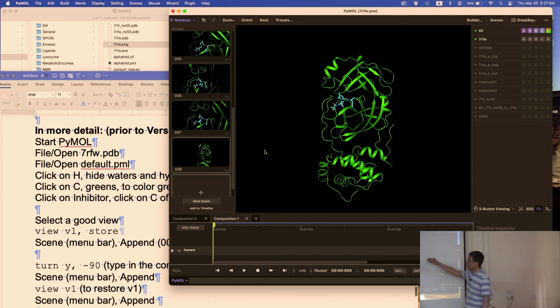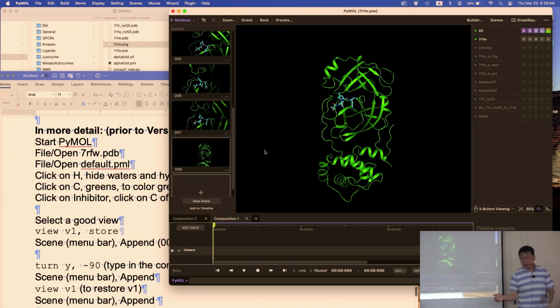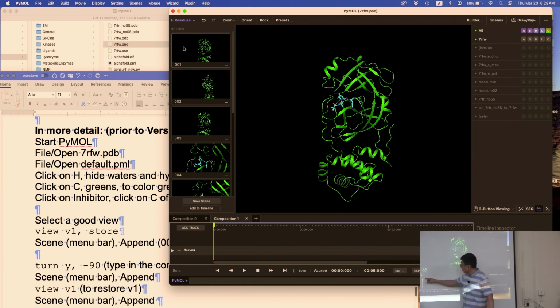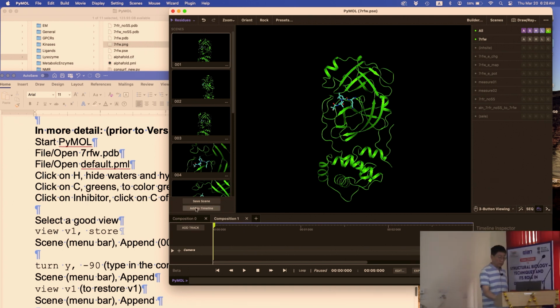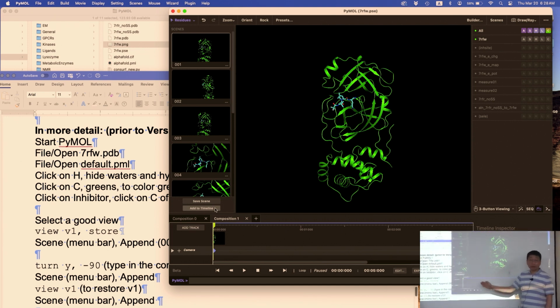So now we can individually add the scenes to the movie. And this is sort of how I learned how to do it. That might be a better way. But so go back to the top, click on the first scene to select it. Got it? The scene 001. And then near the bottom, there is an add to timeline little button. Click on that. Okay? So now you see the scene always adds to 000 because that's where the green bar is.